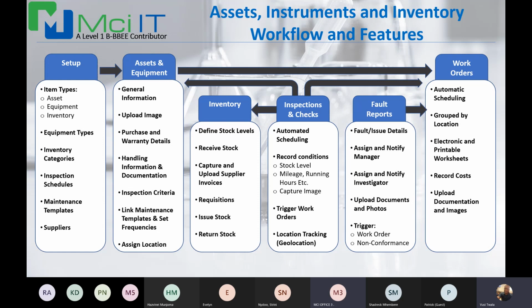So a key system parameter, we feel. So in terms of setup, yes, you can set up asset, equipment, inventory. You can define your equipment types or item types, set up inventory categories, inspection schedules, maintenance templates, and also suppliers.